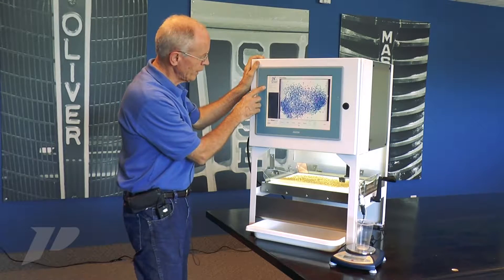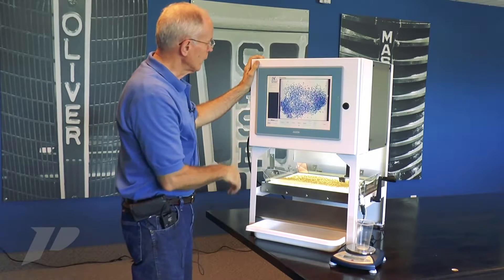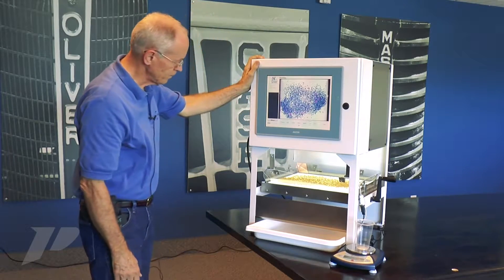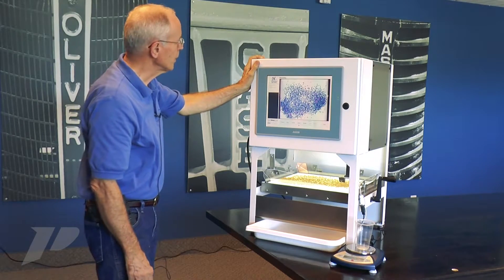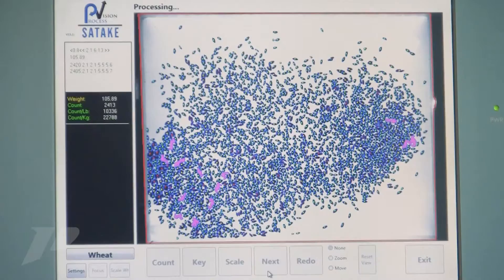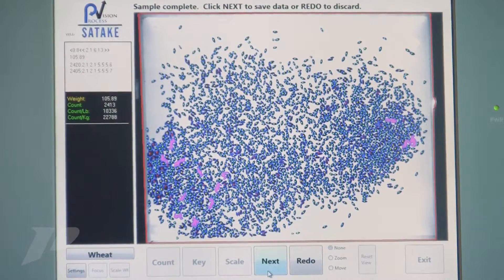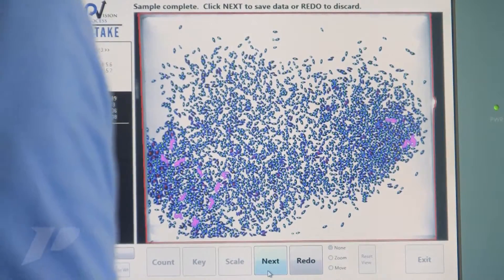We'll show you the count that we had, and we'll vibrate and count again, and the second count is within 15 kernels for a 2400 kernel count.